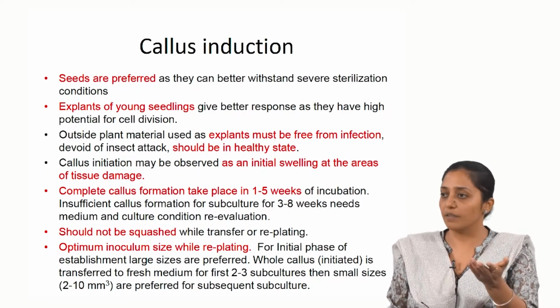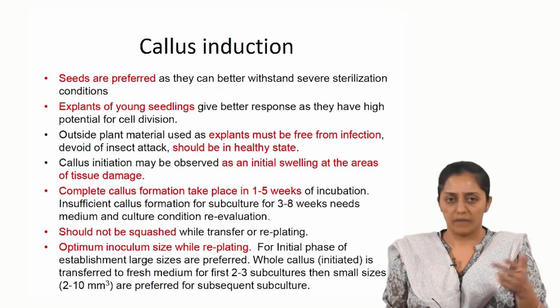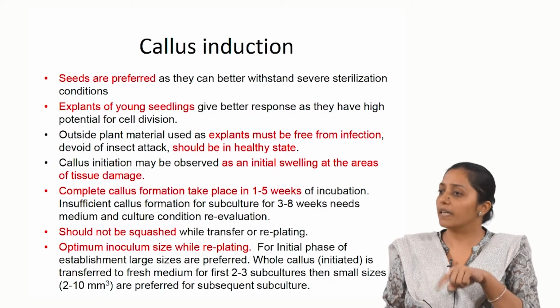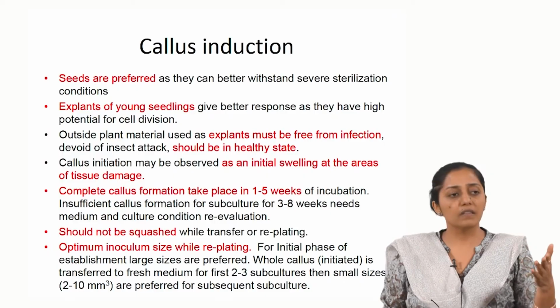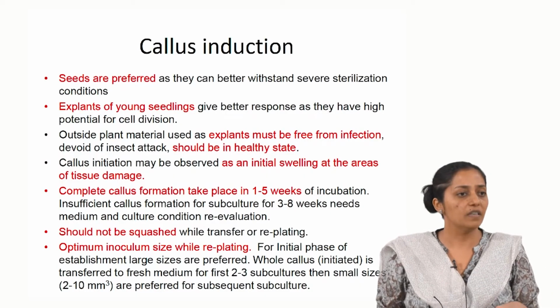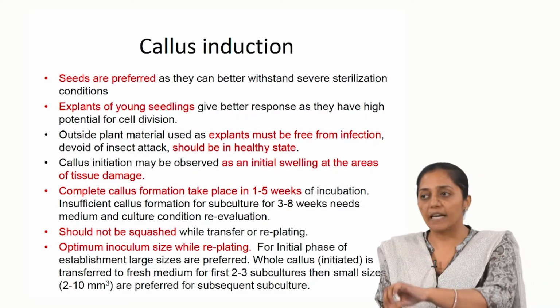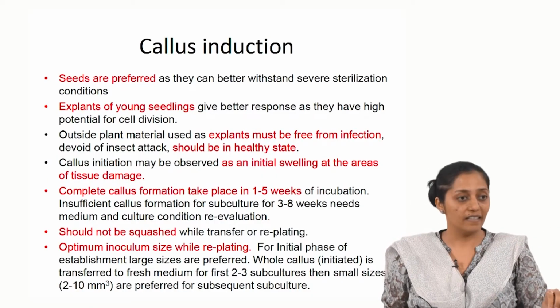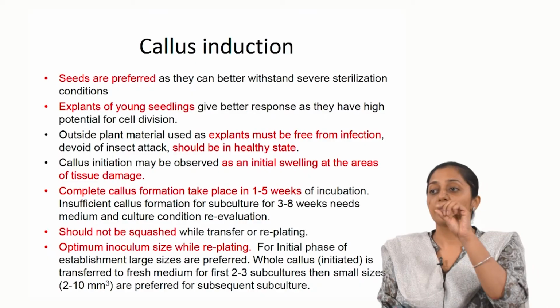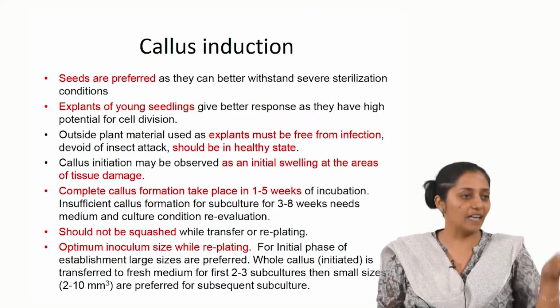I worked with azadirachtin production. So, neem is ubiquitous in our country. It can be found in many regions of the country, but because of the geographic and climatic variation, even in the neem variety which is present in different parts of the country including North and South India, the yields are variable. So, you must pick up a variety which is higher yielding, with high average yields, and then you must pick up that explant or that region of the plant which is highest yielding in that plant.